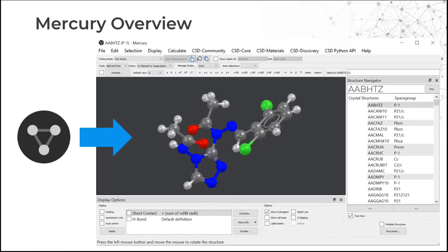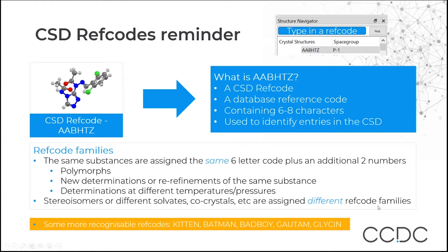This is where we start to see what Mercury looks like. If you have it installed and want to open it, you should see the Mercury icon or you can navigate to Mercury in your start menu. Once we click on the icon, we see the Mercury interface. We can see our 3D visualization, which is the main part of Mercury, and the structures in the CSD listed by ref code.